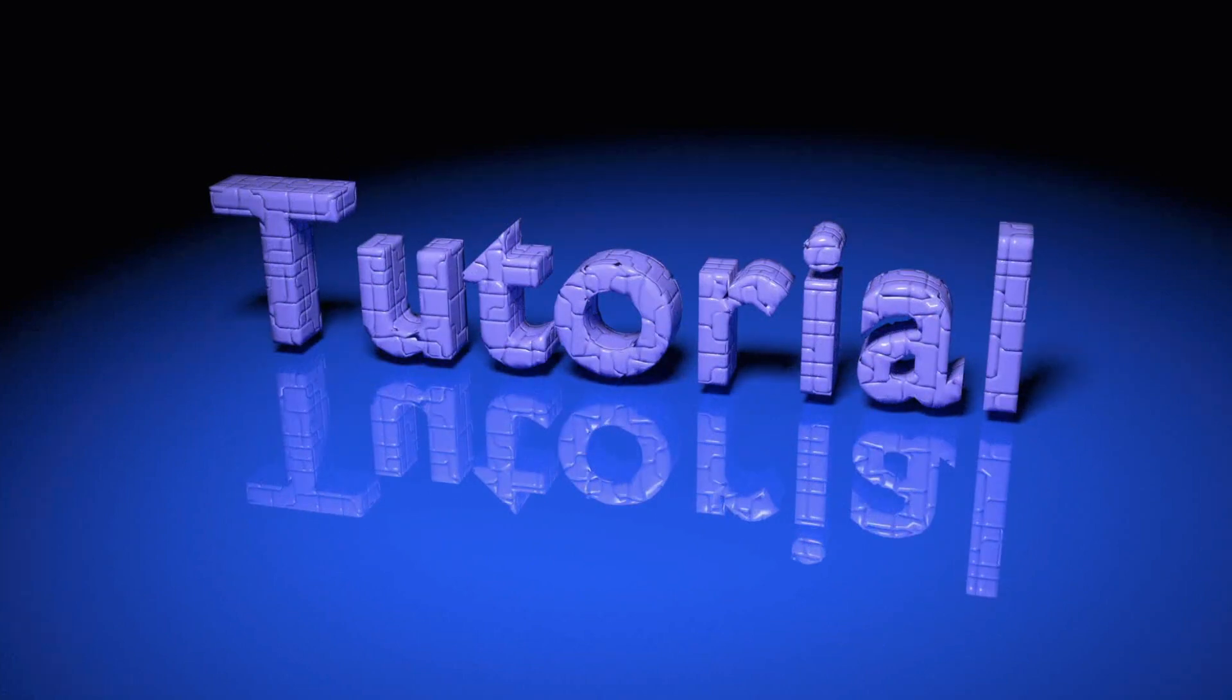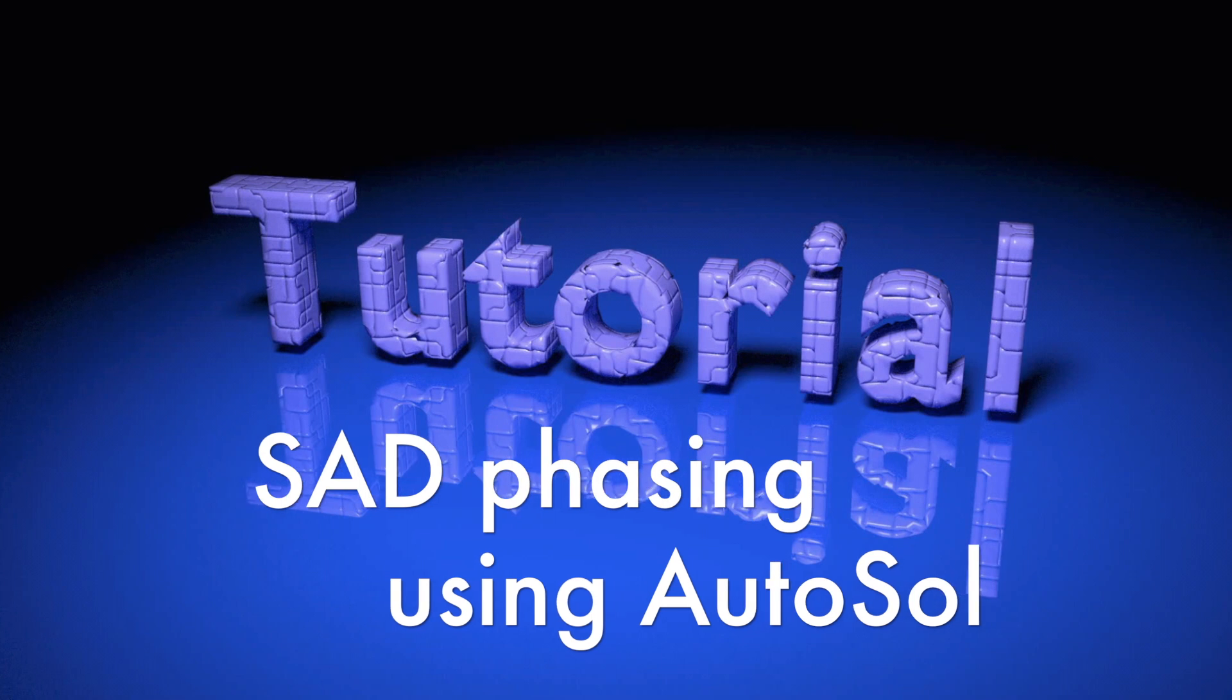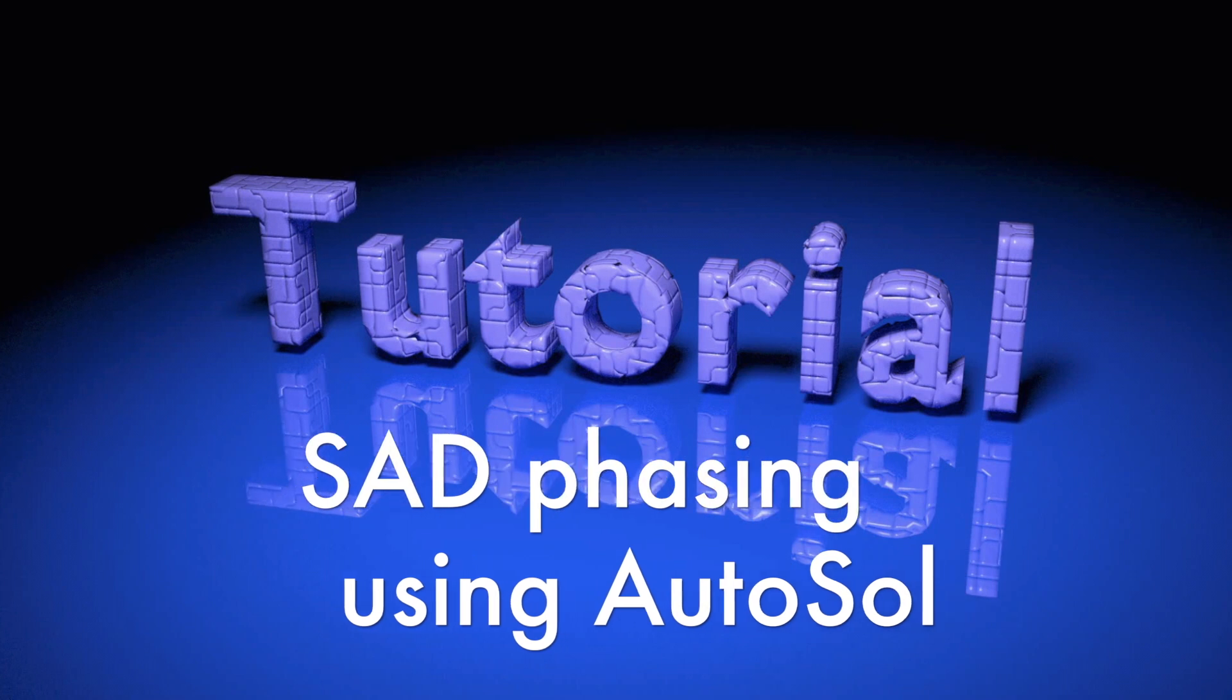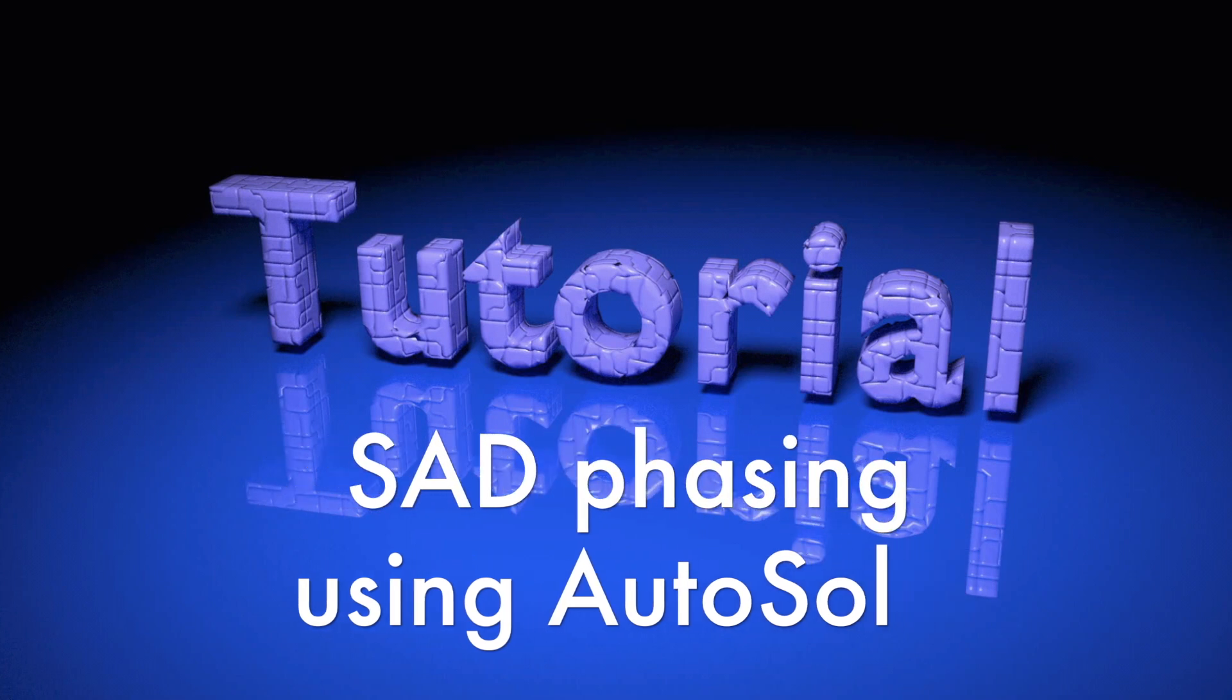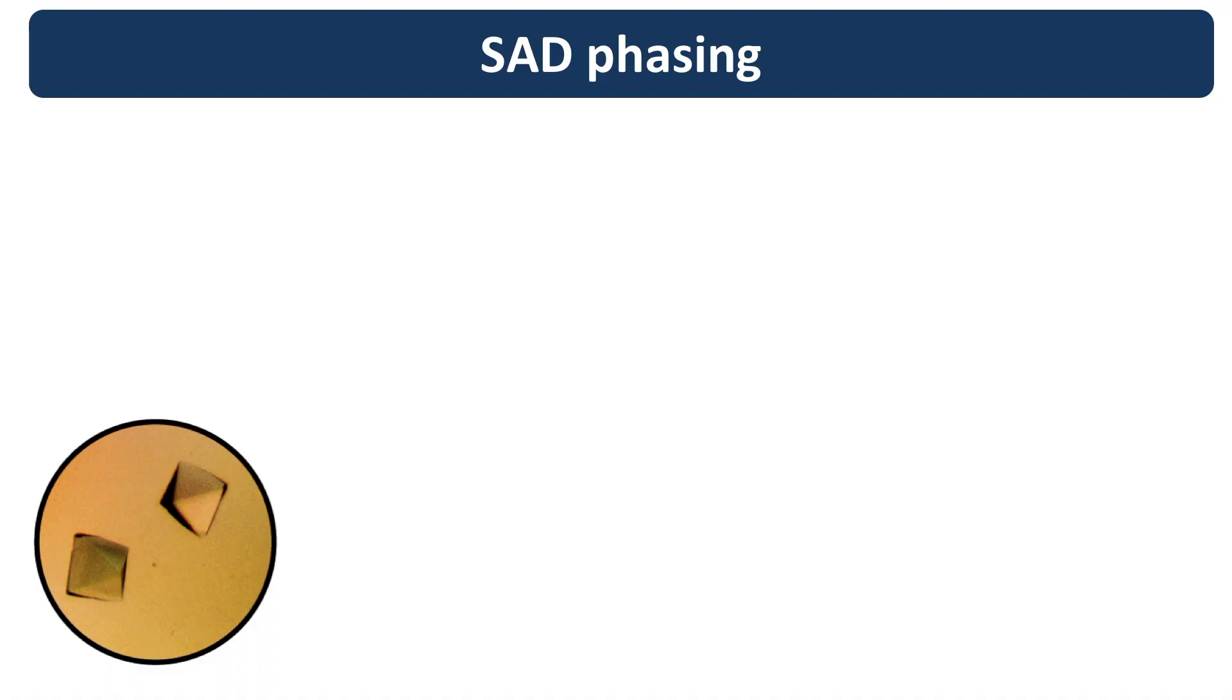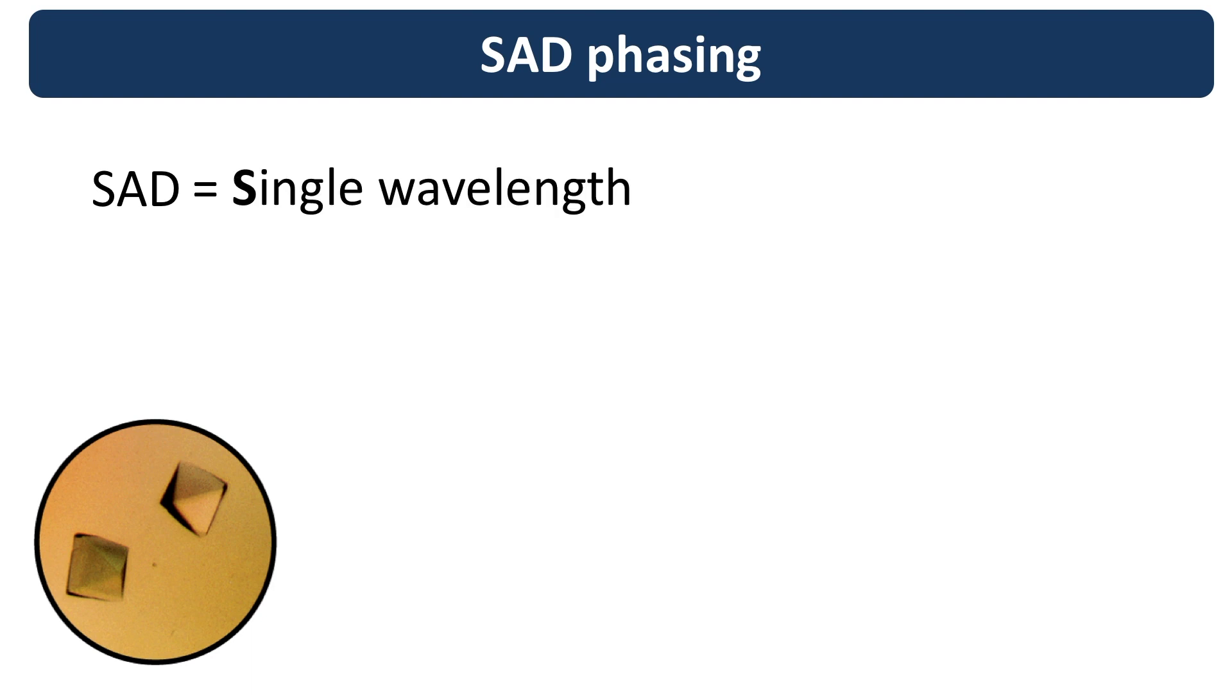Hi everyone! This tutorial explains how to solve a structure by SAD phasing using AutoSol. SAD is a widely used experimental phasing technique and stands for Single Wavelength Anomalous Diffraction.